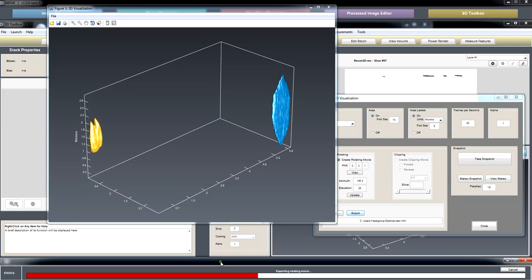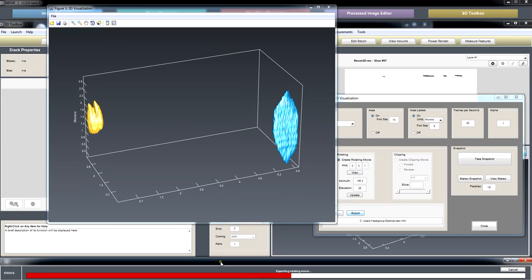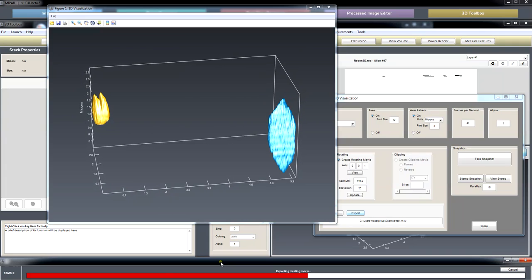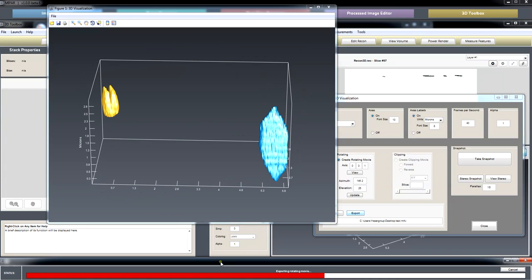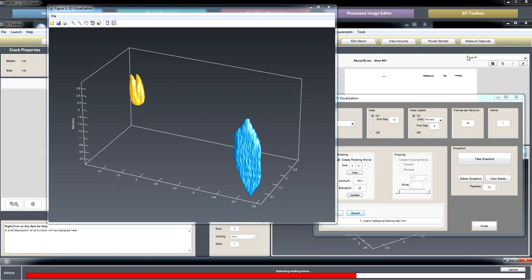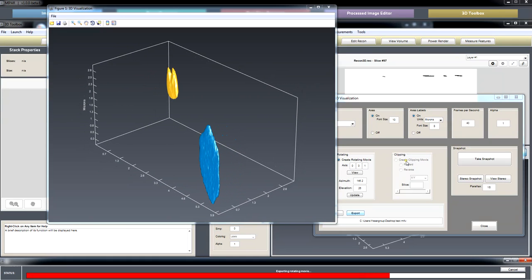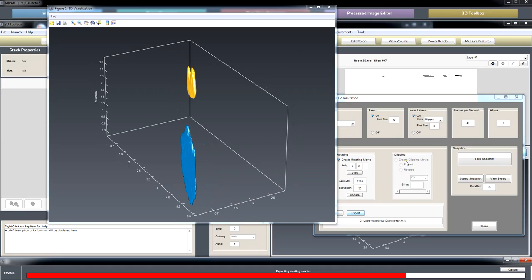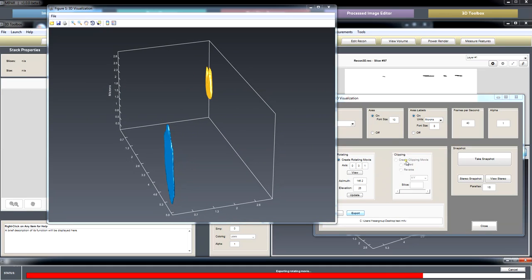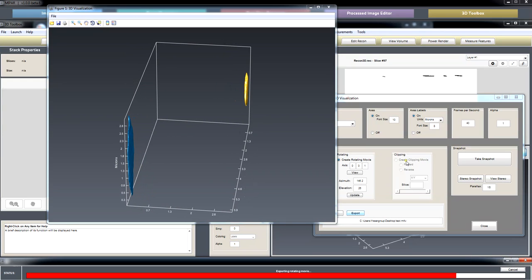QuickTime opens them, Windows Media Player opens them. And the other option for movie making is a clipping movie, and usually use that for like showing you slicing through your reconstruct or aligned reference data. Yeah, exactly.